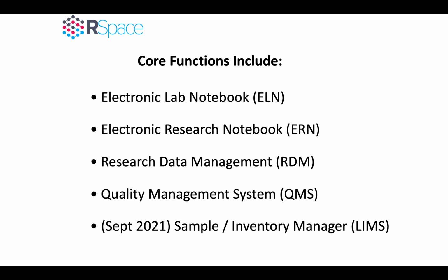RSpace integrates nicely with your modern research data management workflows, and it can also be used to help boost the quality of the workflows performed and the data collected throughout your organization. Starting in September 2021, RSpace will also include a brand new sample and inventory management system.